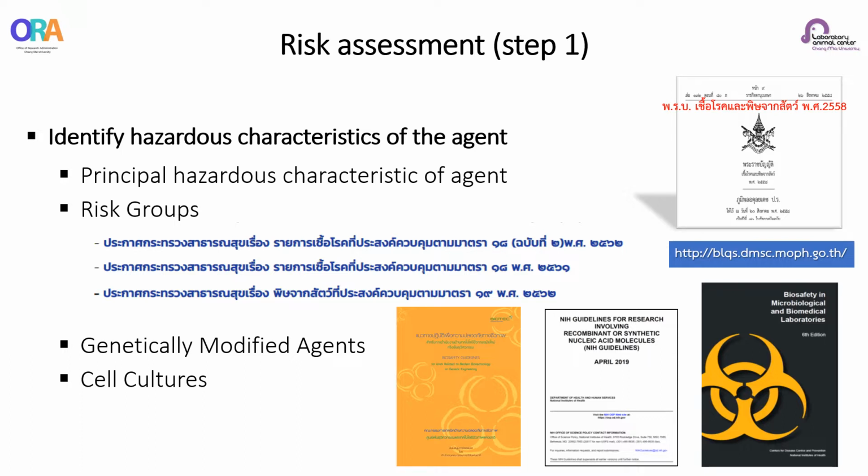And the last is the cell culture. Workers who handle or manipulate human or animal cells and tissue are at risk for possible exposure to potentially infectious agents that may be present in those cells and tissue.